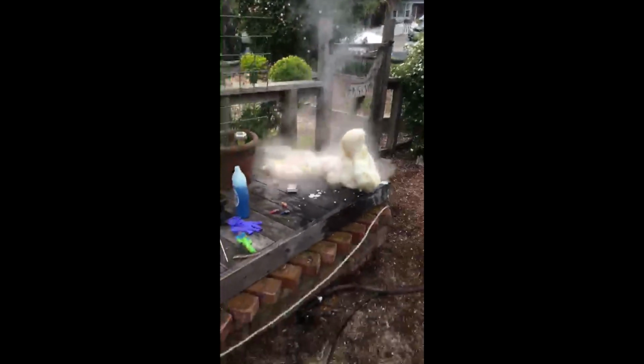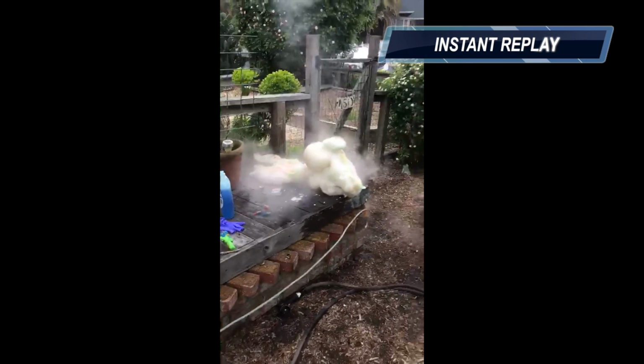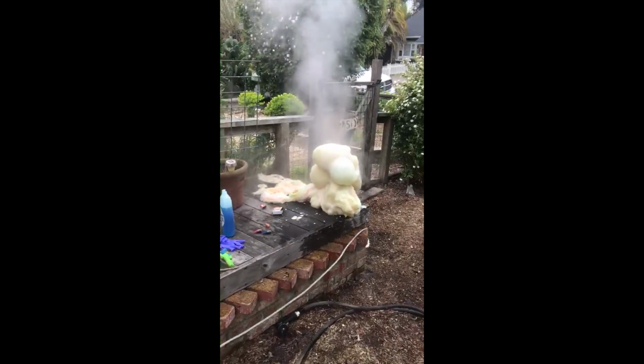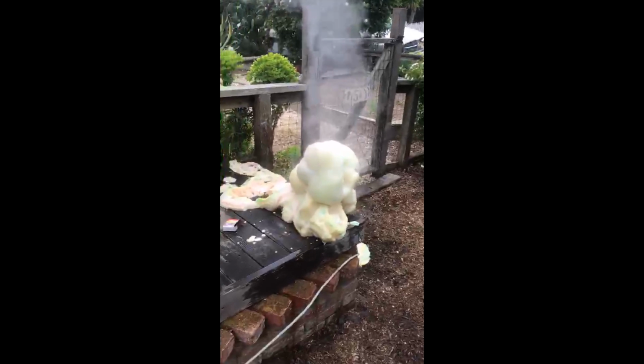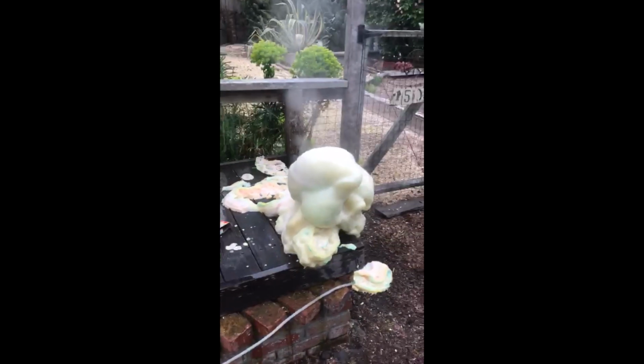There we go. Nice. Okay, so I think it can be determined that sodium iodide works better than potassium iodide. That was really cool. That one went really high. Look at that. How high did it go? That's really good. About 1,000 feet in the air. That's good elephant toothpaste right there.